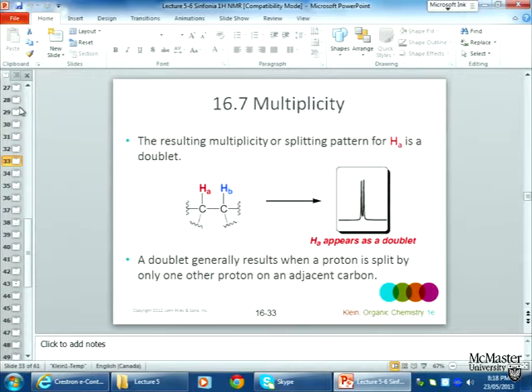So by looking at the coupling patterns of proton HA, we can still integrate here. We can integrate the doublet. The area under the peak is the same. It still corresponds to 1 proton. So we've got information on the environment of HA from its chemical shift and of HB. We've got information on the number of HA protons. By looking at the multiplicity of the peak, the number of signals in the fine splitting, we also get information on the number of neighbors next door. Note that that's independent information.